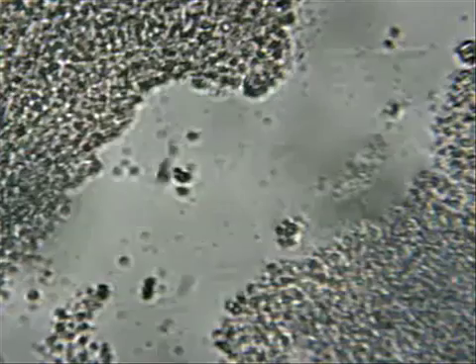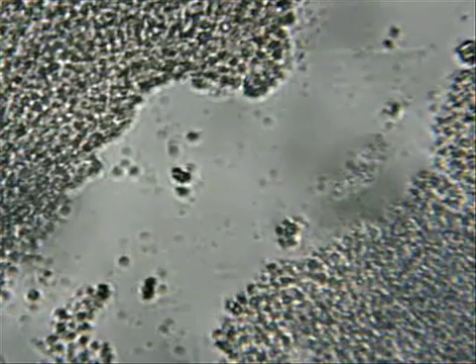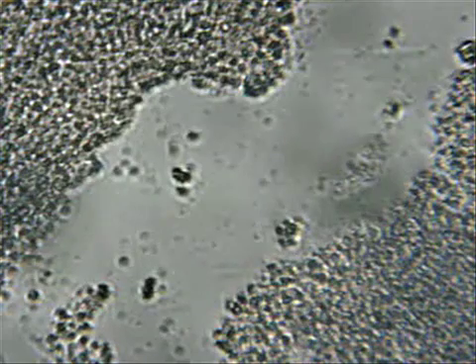It looks like there's a lot more of the stationary stuff, and the variety of different kinds of bacteria might be less on this one. And taste-wise, by the way, it's good — it's just not as tangy.